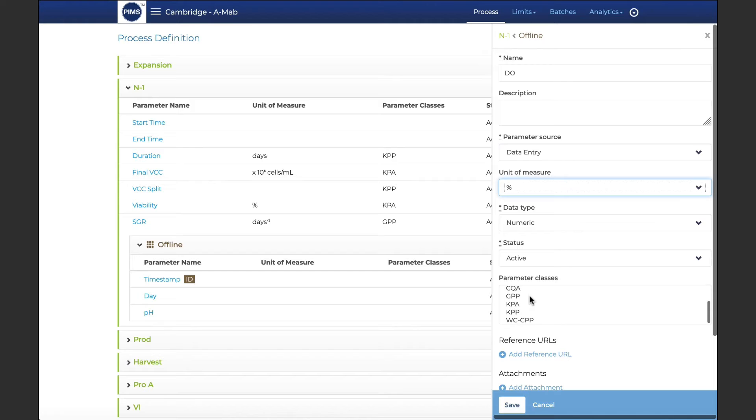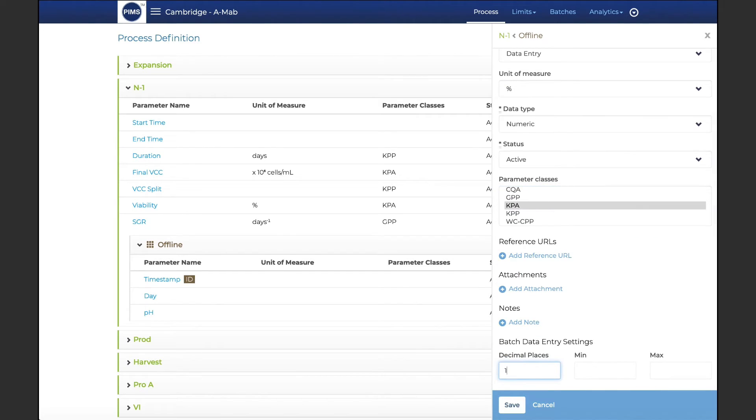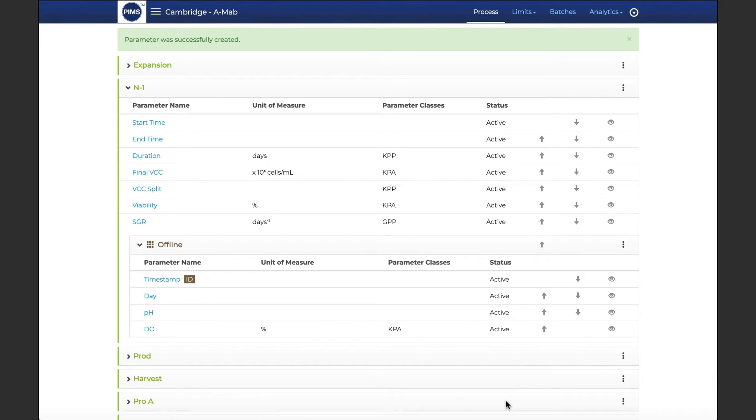Users with assigned roles and permissions can easily create and manage process definitions, which are the foundation for establishing target control limits and compiling and analyzing batch data.